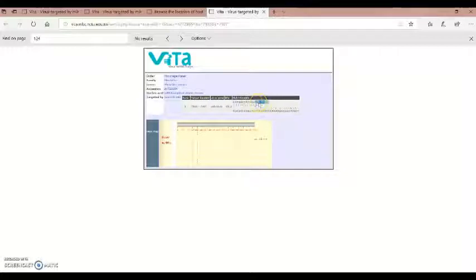So this is the actual strand of 35 nucleotides long of the UTR, and this is then again of our gene of interest, and this is the microRNA binding to it. So here we have some attachment, nothing quite of interest here. Oh, here we have a perfect alignment. It would be better if there was a more clear alignment present right here.